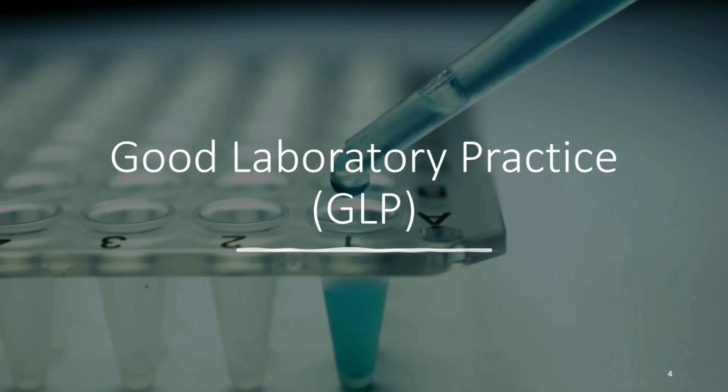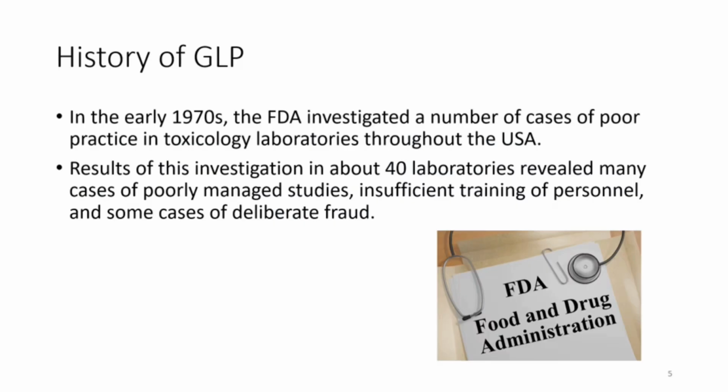In this section, we will be looking at the principles of good laboratory practice as well as its importance. As a science student, regardless of which diploma you are in, most likely you will be required to work in a laboratory. So why is it important for us to have good laboratory practice, and how did it come about in the first place?